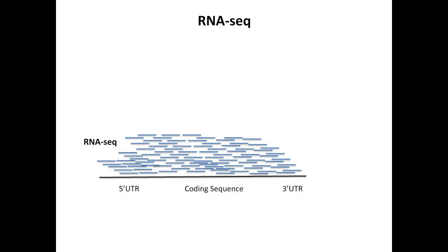So if the goal is to measure gene expression, we don't have to sequence the full transcript as people do in RNA-seq analysis. For quantification purposes, we only need to sequence a small part of each transcript, which with 3' RNA sequencing, we can do. We can just confine sequencing to the end of the transcript.